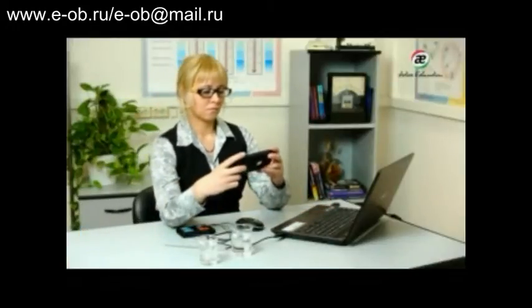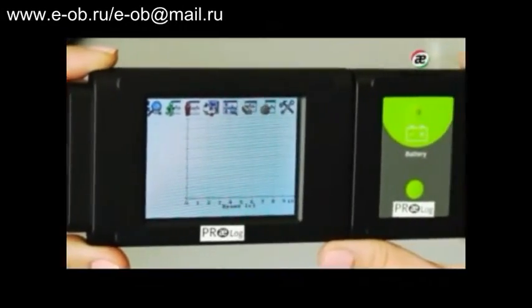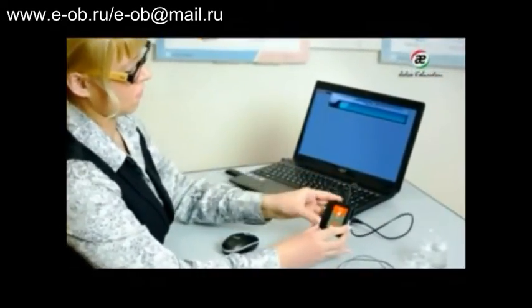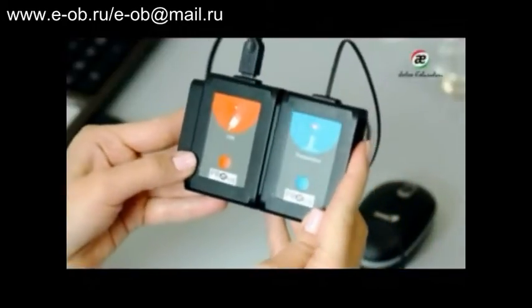The PROLog system has options for experimenting without a computer in the offline experiment mode, with or without the graphic display module. Before an offline experiment without graphic display, you should set up the sensor module. Connect the temperature sensor through the USB bridge module to your computer's USB port. Click Search for sensors. When the module box appears, click the Offline Experiment icon.